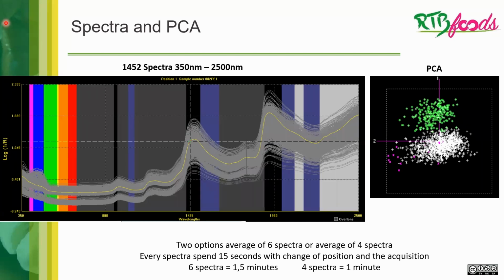Definitely from our own experience from IT, we clearly see there's a difference in the central and the proximal, the middle and the distal. So since Luis has mentioned that he's going to explore it more, it's difficult to use the central to represent the whole root. Yeah. Okay, thank you, Manuel.